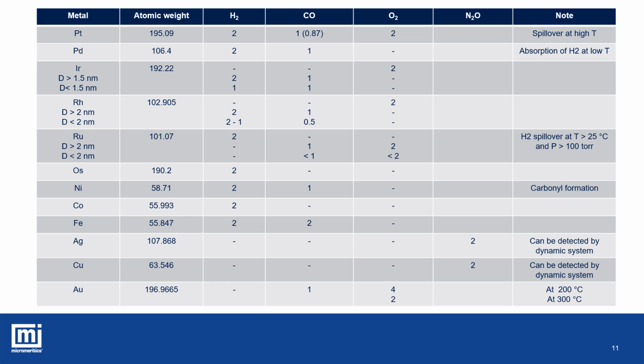In this table, some side effects are put in evidence, like the spillover of hydrogen over platinum at high temperature and the long equilibrium time for hydrogen on ruthenium due to spillover even at room temperature.